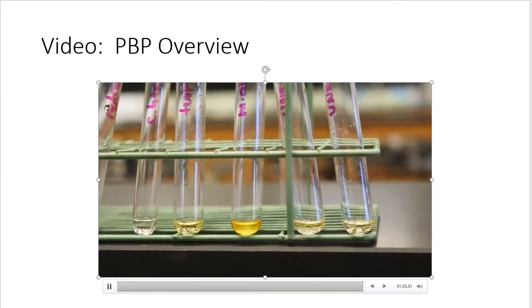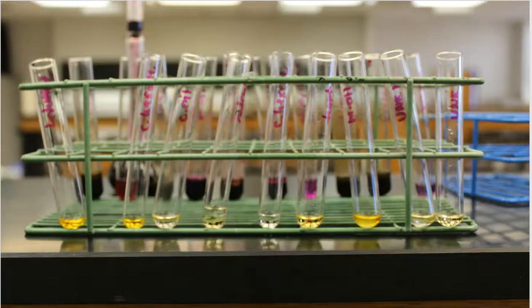All right, now it's on to part 2. See how fun qualitative analysis is? Oh gosh, I mean, if people are going to pay me to do this, I'll do it all day long, but I don't necessarily think that it's fun. Do you? I mean, you probably fell asleep watching the video just like I fell asleep doing the lab.